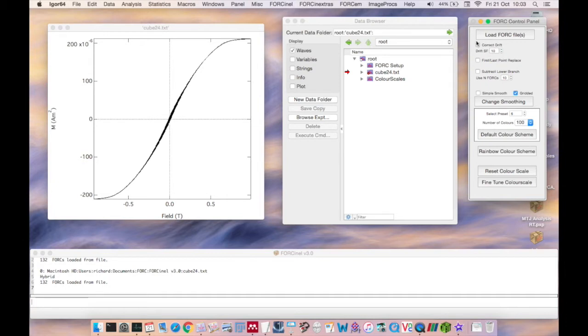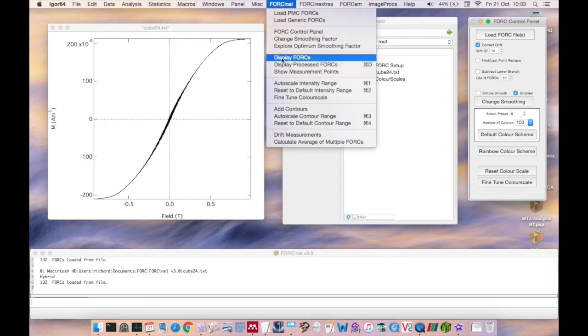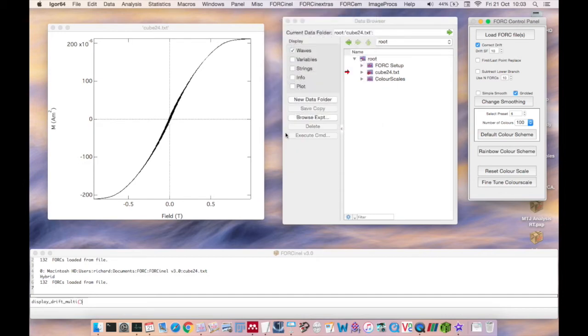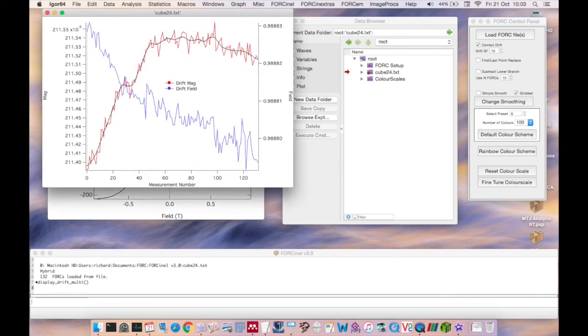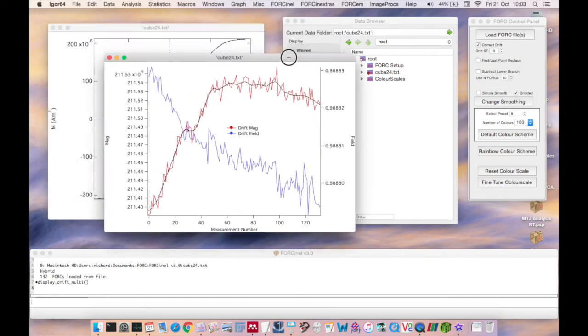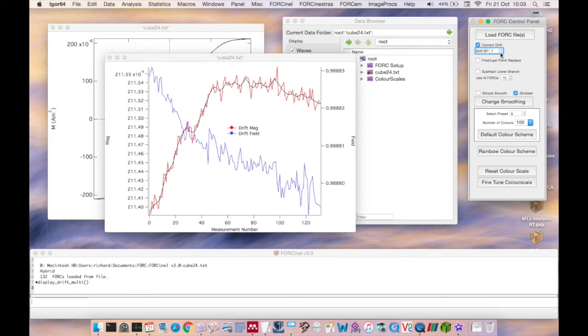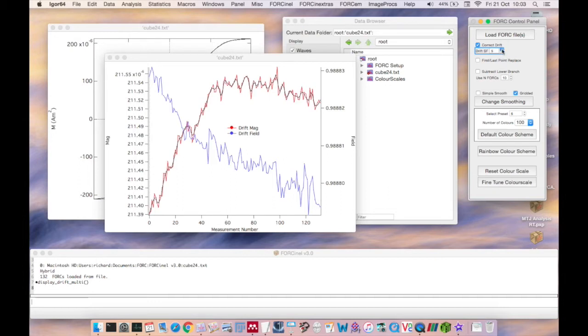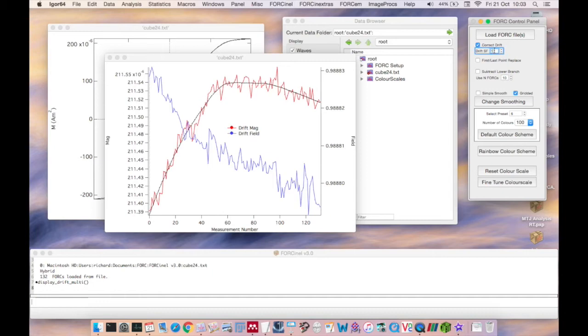The first option you have is Drift Correction. To plot the drift measurements for this fork, go to the ForkNL menu and choose Drift Measurements. You can choose to smooth the drift measurements by changing the smoothing factor on the Fork Control Panel. Too little smoothing means that noise in the drift measurements may be added to your fork data after correction, but too much smoothing and you may start to iron out real contributions to the long-term drift of the instrument. In this case, a value of 10 provides a good compromise.